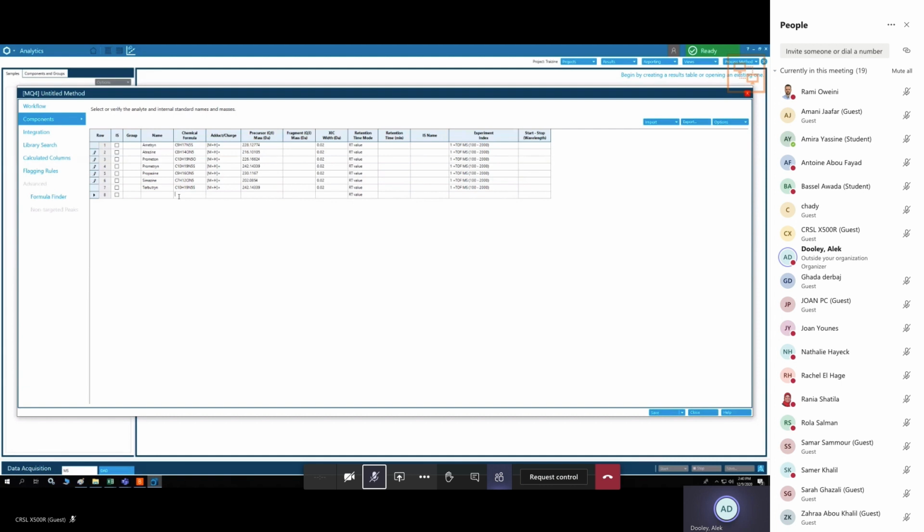If you're using a stable isotope, you can put it as you would the correct notation. So, for example, if you have a C13 label, you can put brackets, and then you can put 13C5, which would be 5 carbon-13 atoms, and you see it knows that. Okay, it's confused because I didn't put a name.